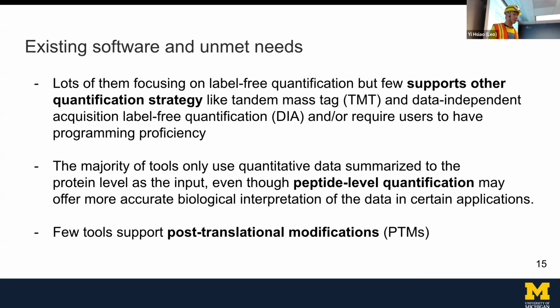And since proteomics is a technique kind of different from RNA-seq, the experimental design really depends on what kinds of readout you want. You probably want to focus on some residue of a protein or even a peptide. So some of the recent trends is, are we able to do peptide level quantification and also do analysis at the peptide level?